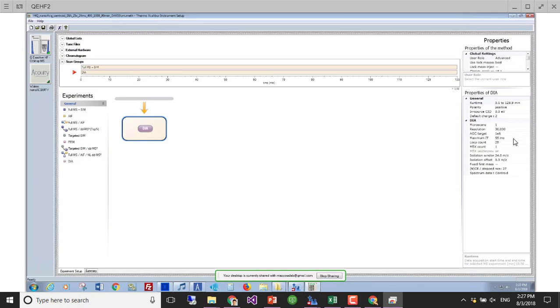Because there you care less about the quality of each individual scan, because all you need to do is make a detection from that scan. Here we actually care about making quantitative measurements from those MS2s, so we want to have fairly good accuracy in our MS2s. This is flipped from how you would typically do DDA, where you care a lot about the MS1 scan, you just want a really fast MS2.